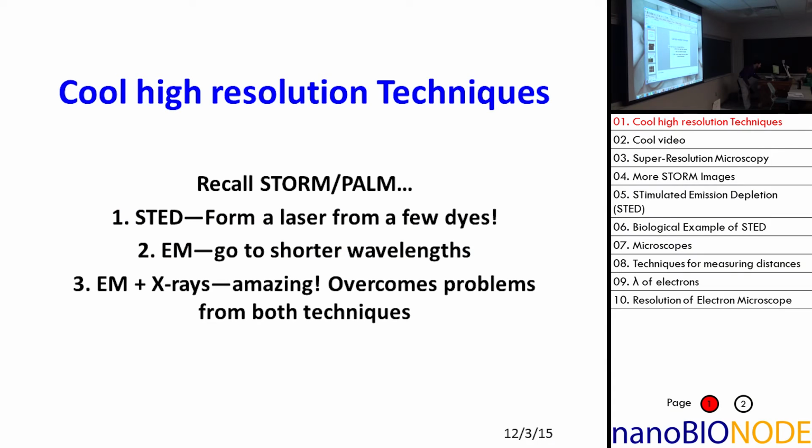Now we are going to get to what we call cool science. In particular, what I've chosen is sort of four or five cool science topics, where we need to recall what STORM and PALM are.